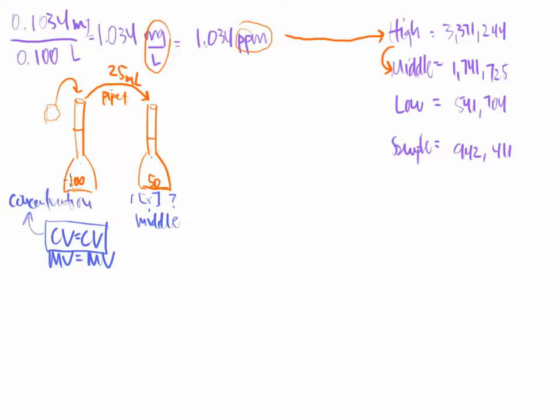So that means molarity can be used, and percent can be used, and parts per million can be used, and parts per billion can be used. Anything can be used in that equation, and it works. It doesn't have to be molarity every time, because we don't make things or report things in molarity every time. So that means that if I know the initial concentration that I made here, and I do, 1.034, right? 1.034 is what I started with.